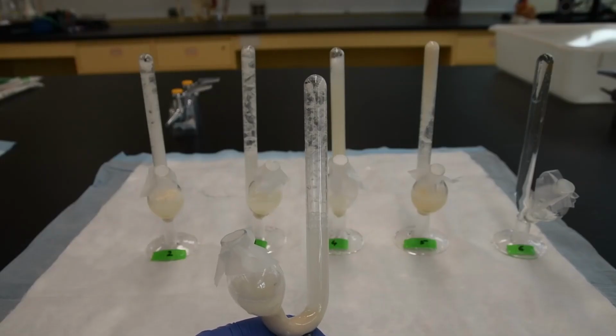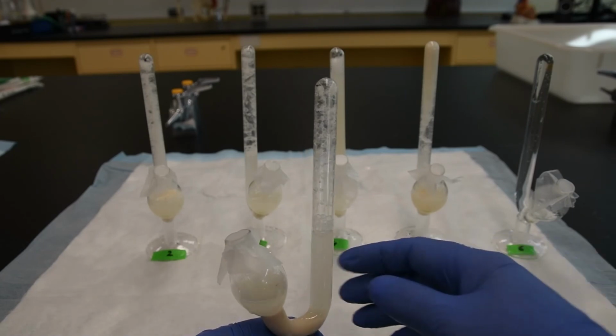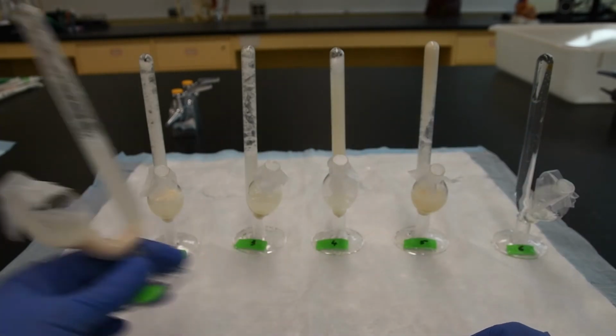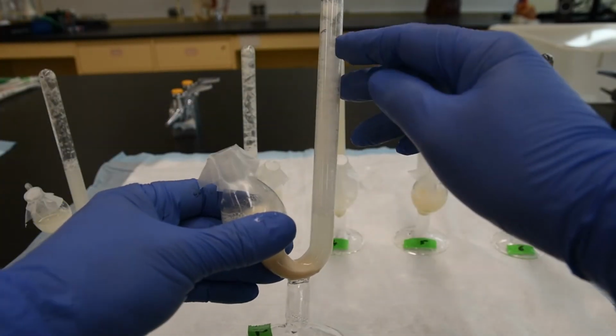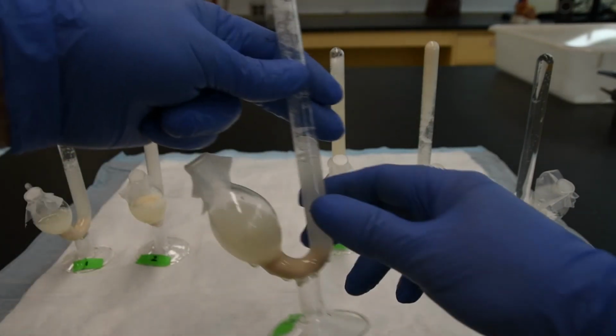Okay, so the experiment's over. I'm just going to quickly show you the tube. So you can see quite a big air bubble in this one at the end of play, from here to the marker made up there. It's tube number 2. See, even bigger one here. Goes from here to the marker made up about there. 3.